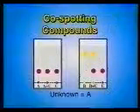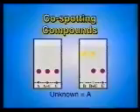RF values are not absolute but relative. Because it is virtually impossible to standardize the activity of the support on the TLC plates, the application of RF values from one analysis to another is useful primarily to indicate the likely region to look for a compound on a TLC plate. When the TLC is developed in conjunction with an authentic sample of the compound, a so-called standard, the RF value is more accurate.